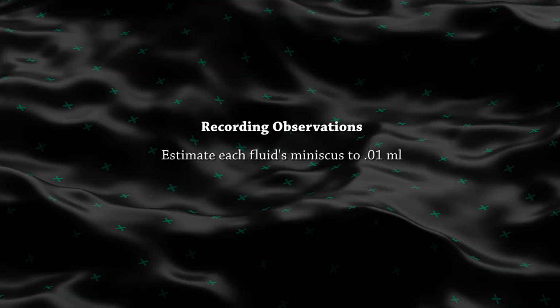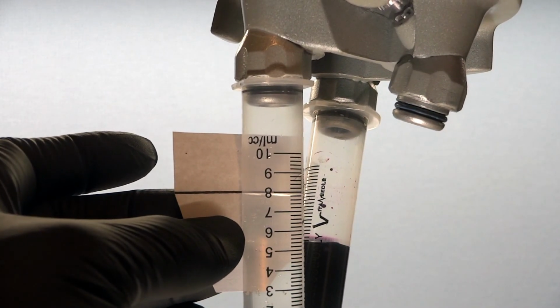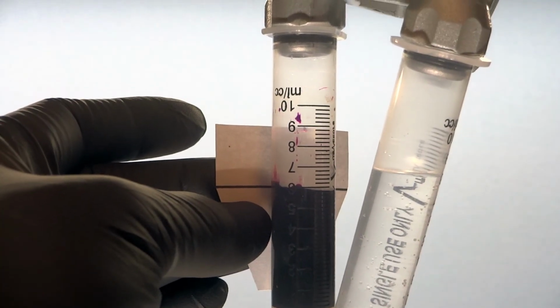We'll use a ruled card to read the volume remaining in each cartridge. This card may be found in TriaDart II's instruction booklet, available as a PDF on our website. By the way, we want to thoroughly rinse all equipment with water between titrations.